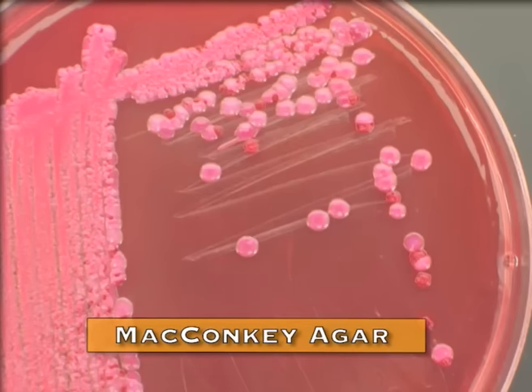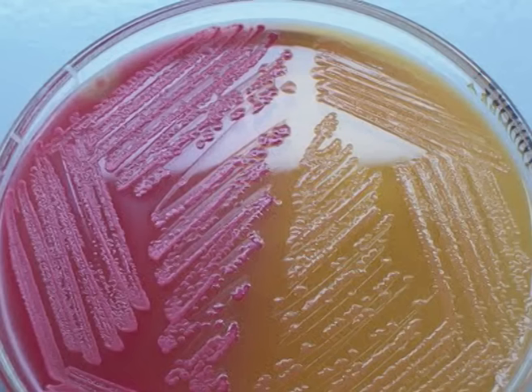Another selective medium is MacConkey agar. MacConkey agar is useful for selecting the lactose fermenters or the enterobacteria. It generally contains bile salts which prevent the growth of gram-positive bacteria.